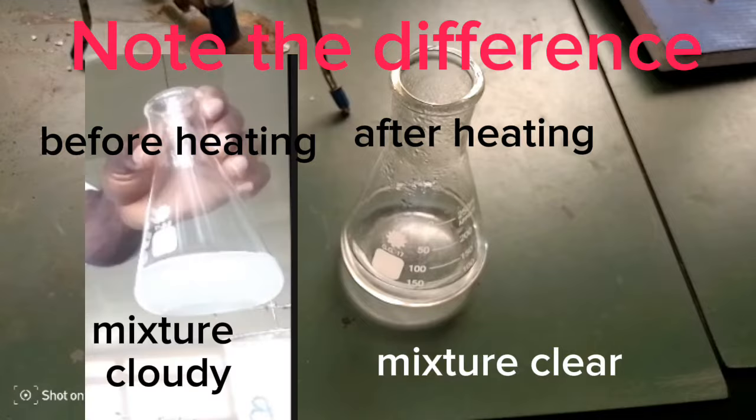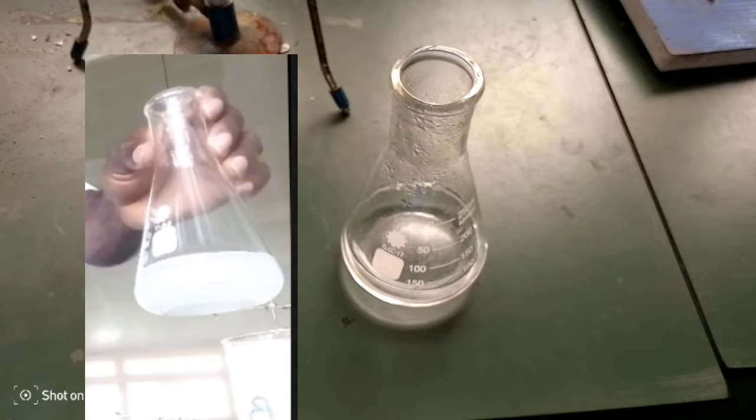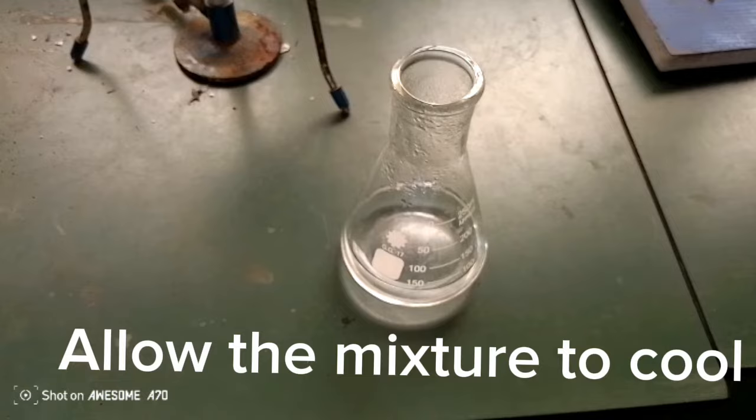Note the difference. Allow the mixture to cool.